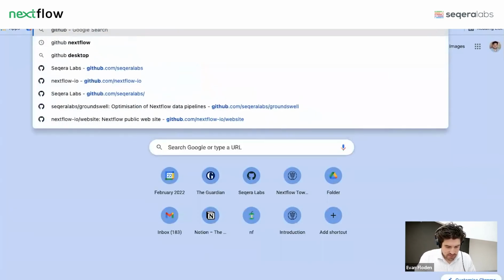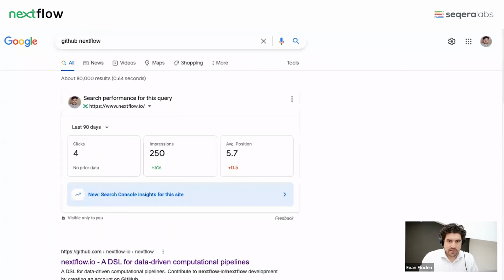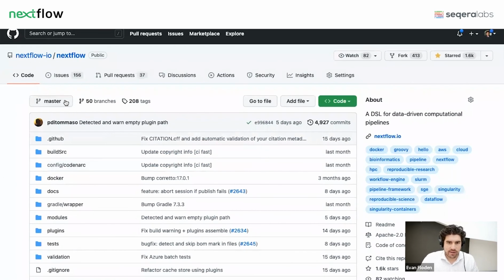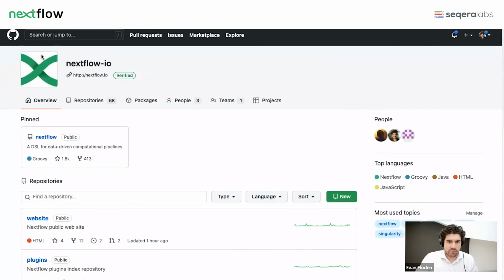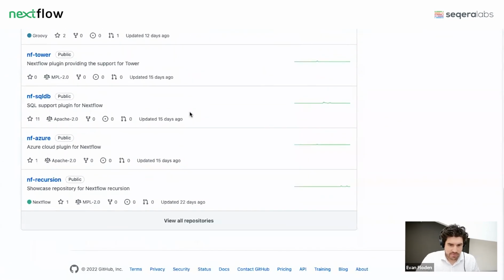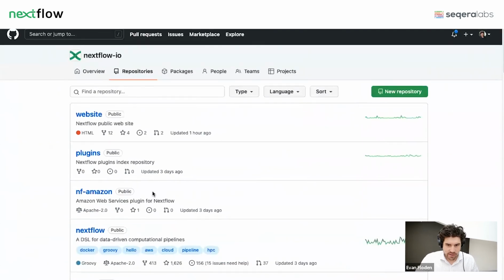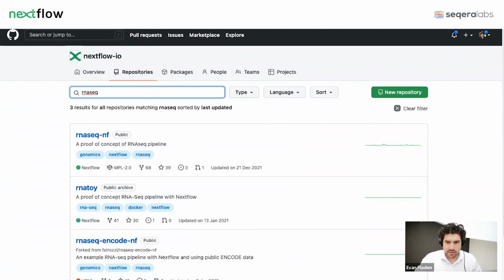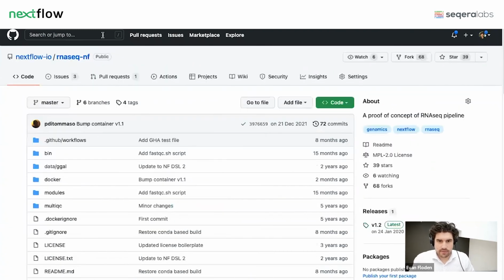If we go to GitHub and go to Nextflow here, we have this pipeline, which is called rnaseq-nf. It's very similar to the one that we've just been running before. Essentially the same steps. It just has some differences in that it's updated for DSL2. I'll go through here and find rnaseq-nf. I'll paste this for you in the channel. Okay, so just pasting that inside there.